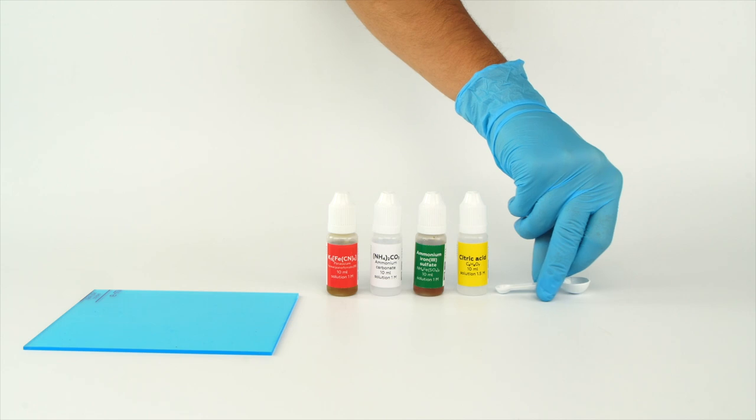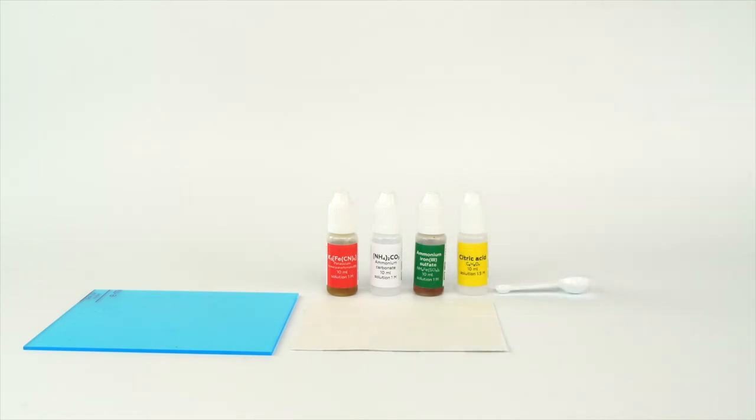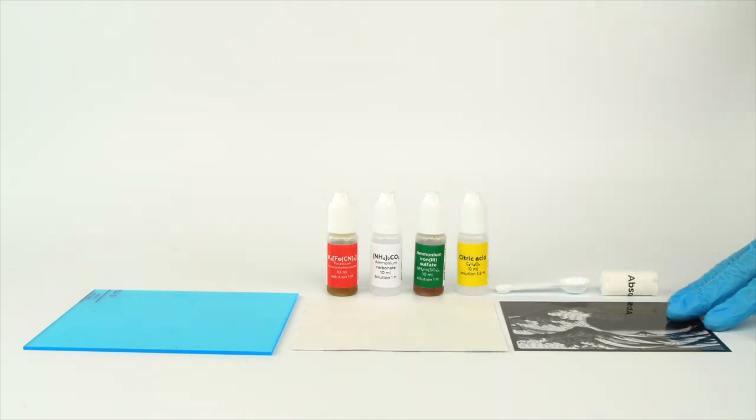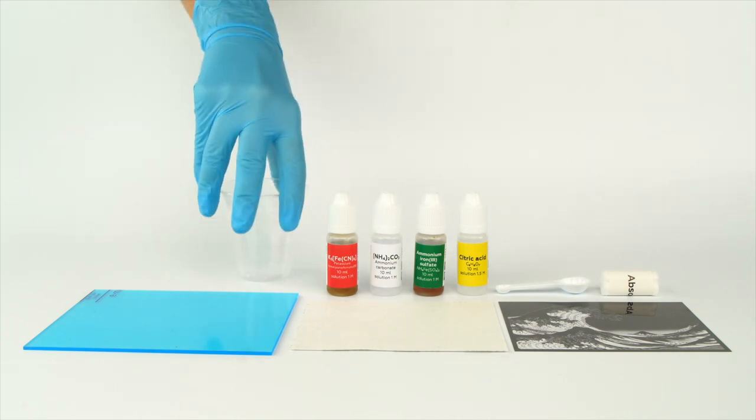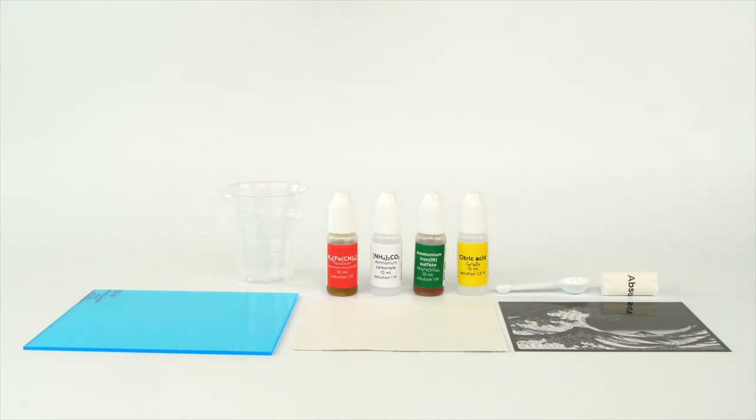Take the plexiglass, a measuring spoon, a sheet of watercolor paper, an absorbent, and the negative image from the experiment set. Take a disposable cup from your starter kit. Make sure you have a working table lamp. Also, keep in mind that you'll need to rinse your print with water at the end of the experiment.